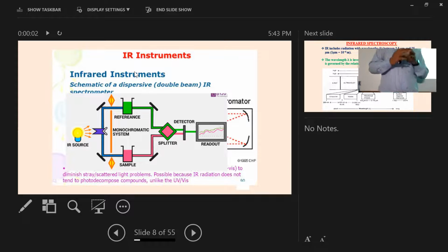If the molecule has some vibration, I have mentioned for water, it can absorb only 3 different types of vibrations. If you give continuous wavelength of IR, only 3 wavelengths will be absorbed by the water molecule. What are they? I mentioned one of them, around 1658 or 1600 plus. That is for the bending. This is our bending vibration for the water molecule.